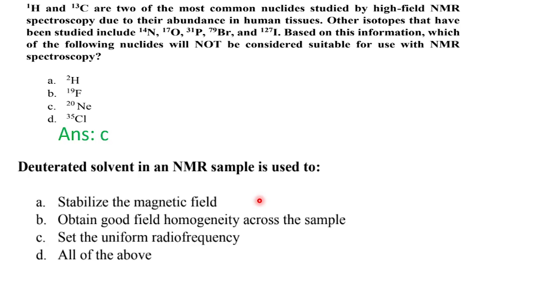When you are substituting the proton of chloroform, that is CHCl3, you are substituting H by D. So it is not possible to substitute 100% H with deuterium. So that's why there must be at least 0.01% or 0.001% CHCl3, and that is why you will get a very sharp peak for different solvents at different delta values. Okay.